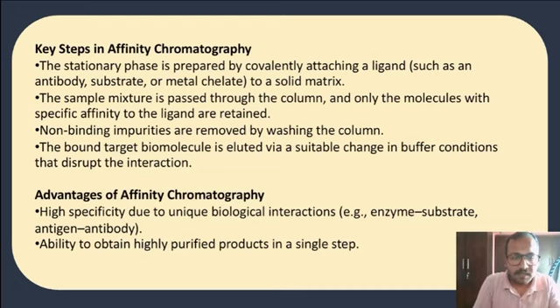The advantages of using affinity chromatography: it has high specificity due to unique biological interactions such as enzyme and substrate activity and antigen antibody activity. It has the ability to obtain highly purified products in a single step.